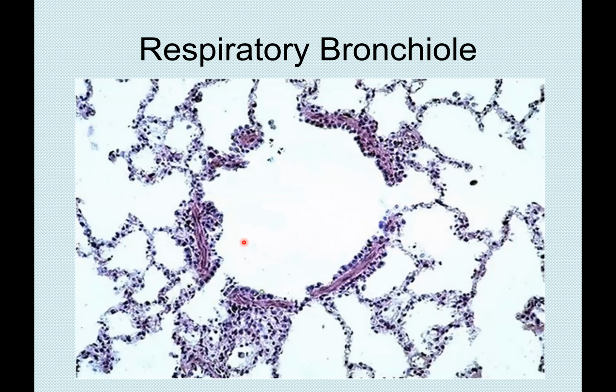I'm just bringing more pictures, okay? So these are different states. This is your alveoli with your simple squamous epithelium. This is your alveolar duct, okay? The respiratory bronchiole has some smooth muscles in there. Here you don't expect to see any goblet cell.